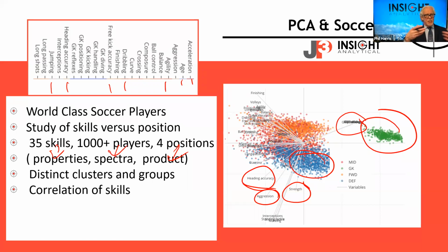So we get statistical feedback from these sorts of models that is kind of a quality measure. If you think about fitting a straight line, you get an R squared number, right? And you go, this is how good my curve fit was. We get that same sort of statistical stuff when we're modeling these. So we can sometimes predict bad results, but we often know we're predicting bad results.